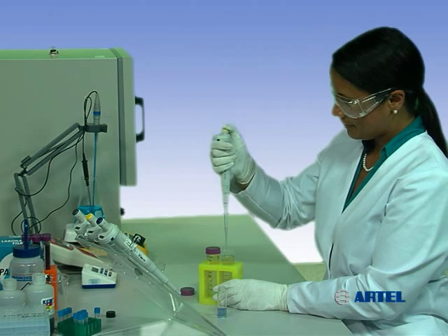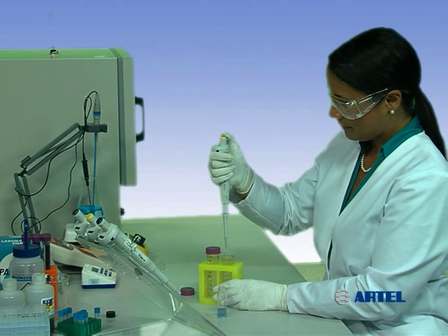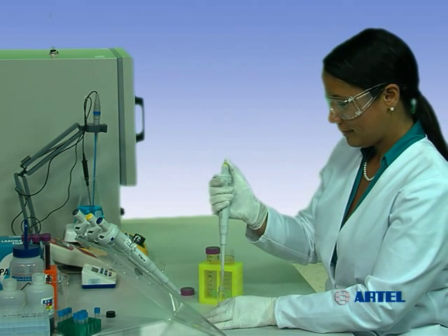For instance, as the pipet heats up, the air space inside the tip expands and pushes the liquid out of the tip, causing less sample to be delivered.